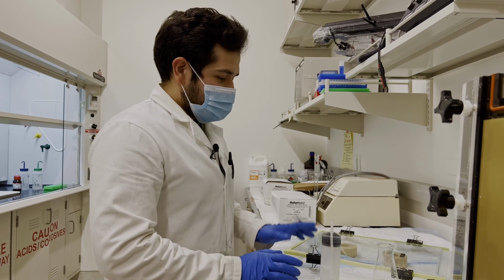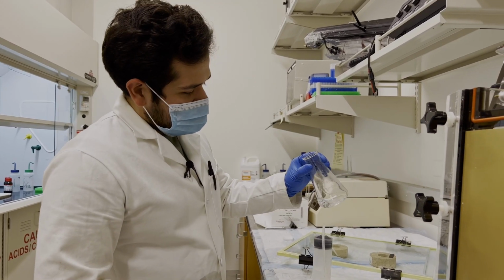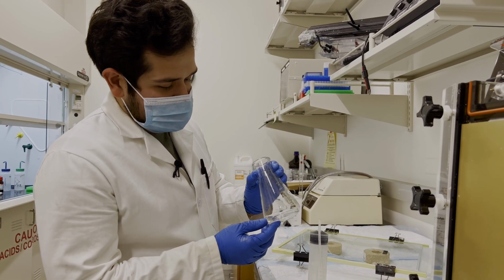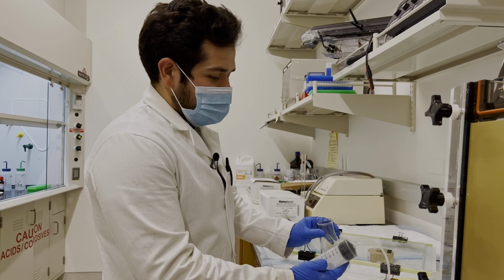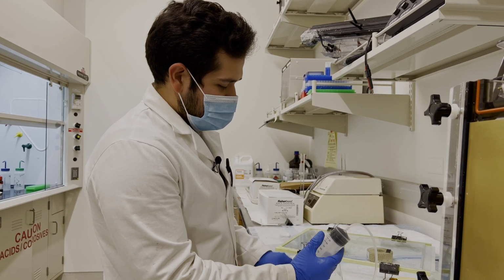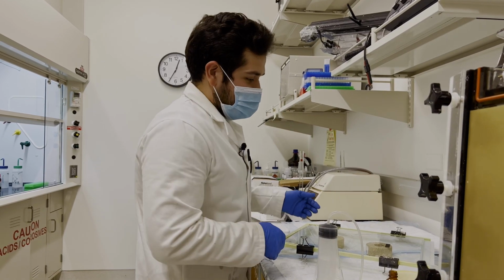If you're wondering if your gel has solidified, usually you'll have a bit of solution still left here in your flask. As you can see, we have quite a bit, still about 10 mLs. You'll probably also have another bit found in your syringe. Once these have polymerized, that means your gel should also be completely polymerized.